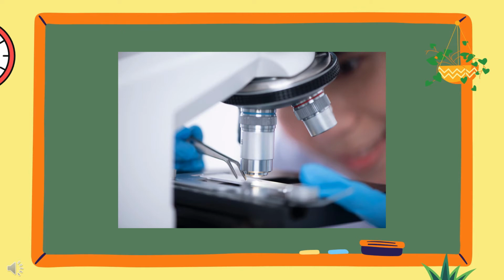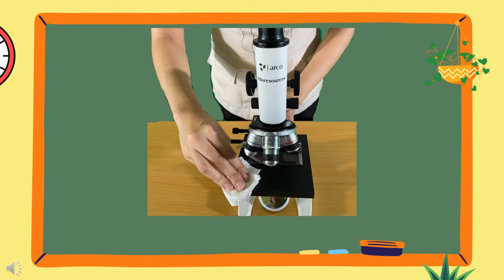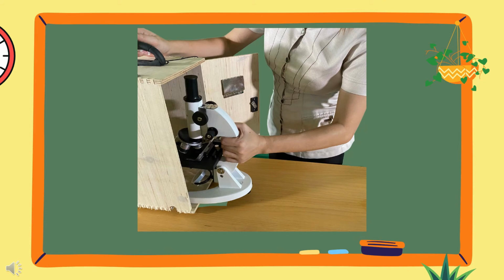inside our mobile phones. Aside from knowing about the essentials of the microscope and its functions, it is also important to learn and practice how to take good care of this instrument. You should always follow the guidelines on how to maintain the good working condition of the microscope. If you are given the opportunity to use it, handle it properly and clean its parts using the appropriate materials. Return it to its proper casing and store in a clean and dry storage cabinet away from laboratory chemicals.